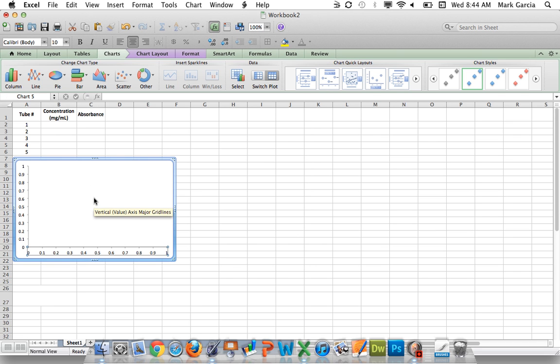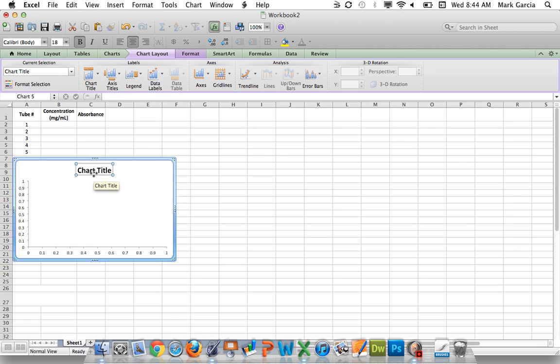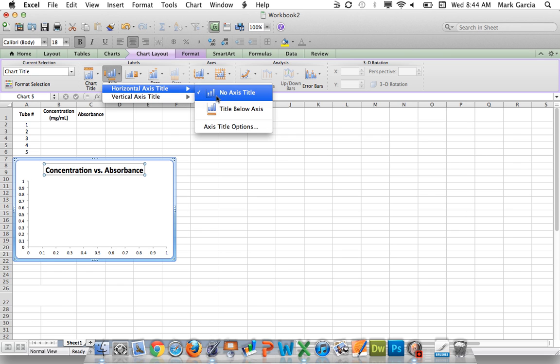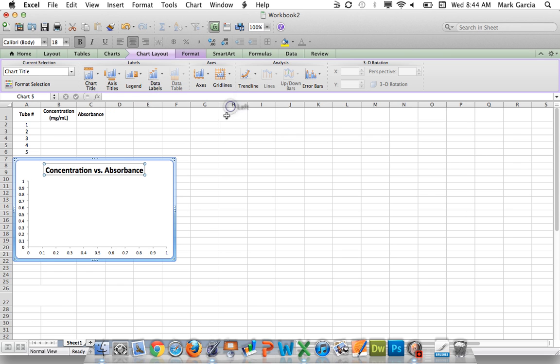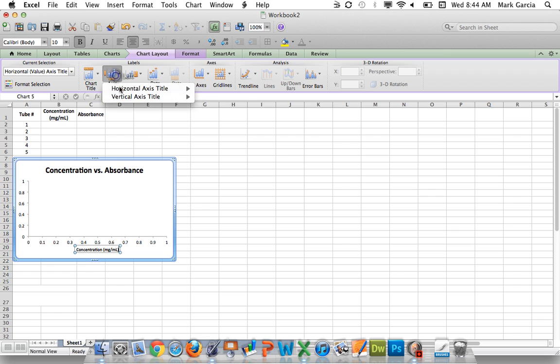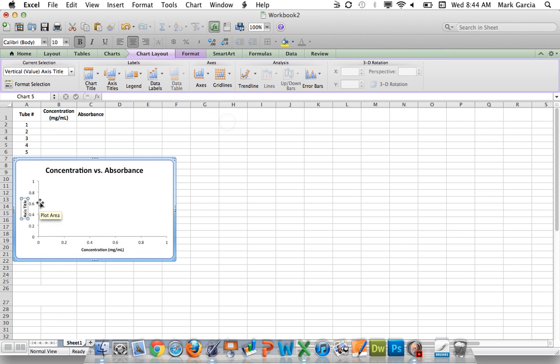Now I'm going to go to chart layout in the ribbon, and I'm going to add a title, title above the chart, and it's going to be concentration versus absorbance. Then for my axis titles, horizontal axis, my title below the axis is going to be concentration in milligrams per milliliter. And then I'm going to again choose axis titles, vertical axis title, and I'll do rotated title. And this is going to be absorbance. OK.